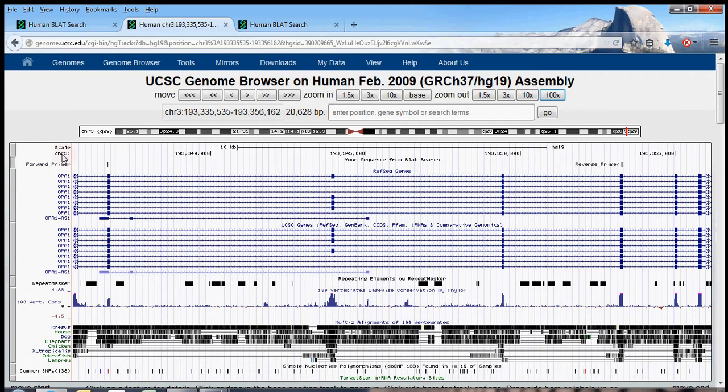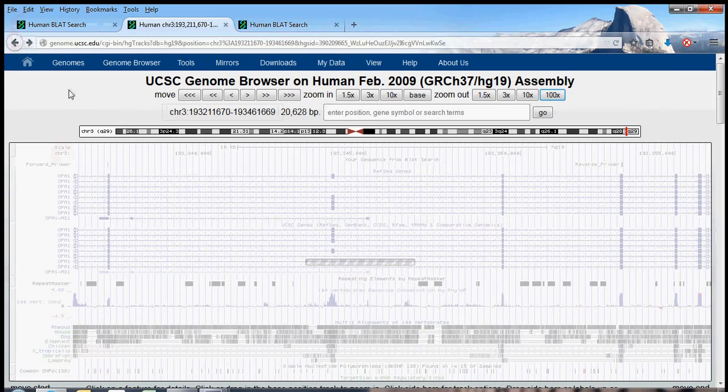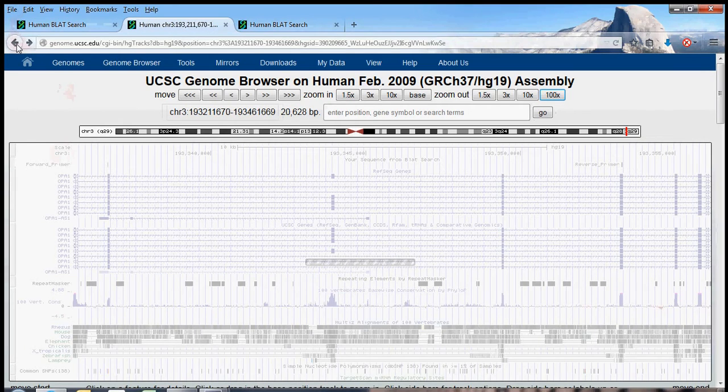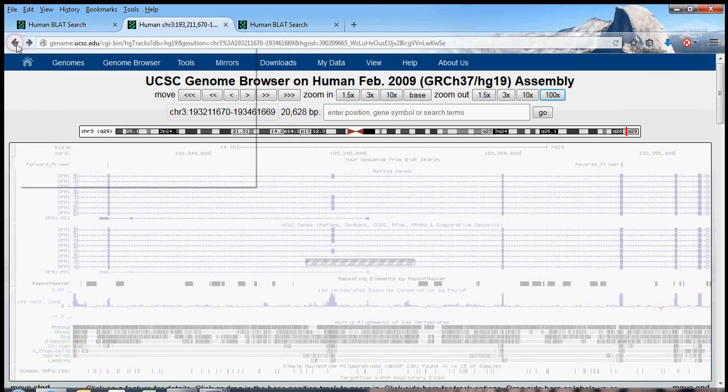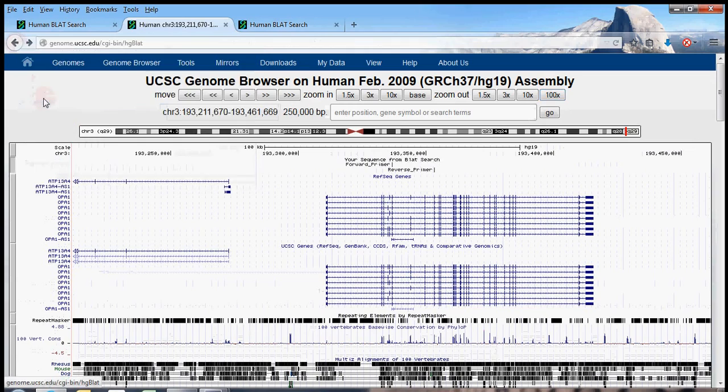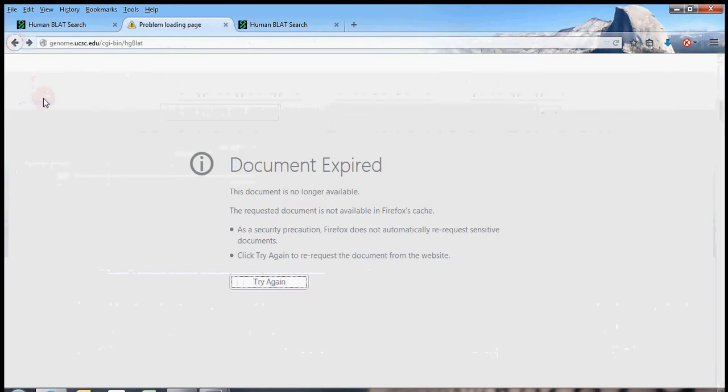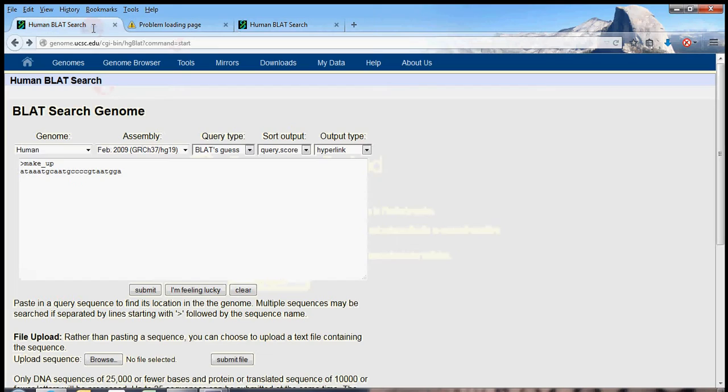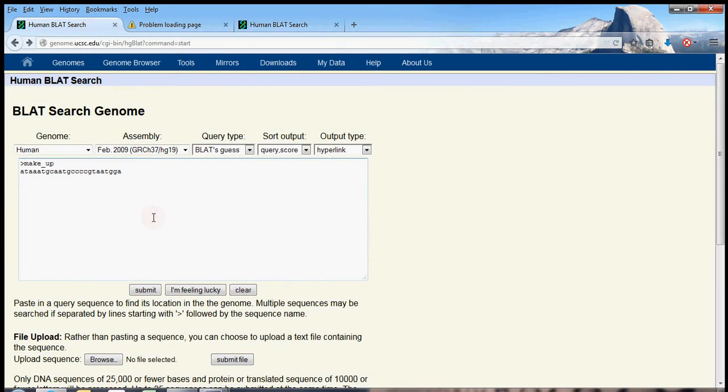So we just saw that BLAT can be used to verify that primers will amplify the sequence that we want. In this case, it was cDNA of OPA1. And furthermore, if you remember, BLAT returned only two responses, which means that I should get the product that I want and nothing else.